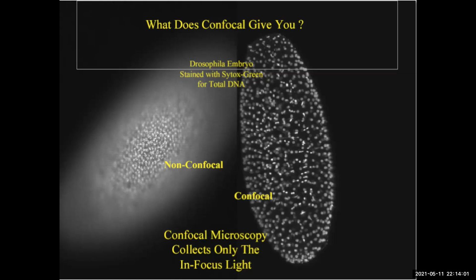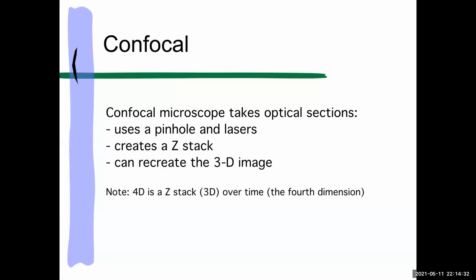Sometimes wide field is just fine. It depends on what you're doing. And confocals tend to be the one that everybody wants to use, because they're $500,000 and they've got the best objectives, and you just figure like your project's important, and of course you want to use the most expensive tool there is. But in truth, it's important to think about what your question is and which imaging modality can best answer your question. Sometimes it is confocal, very often it is, but not always.